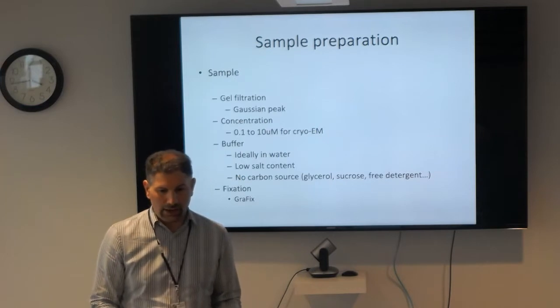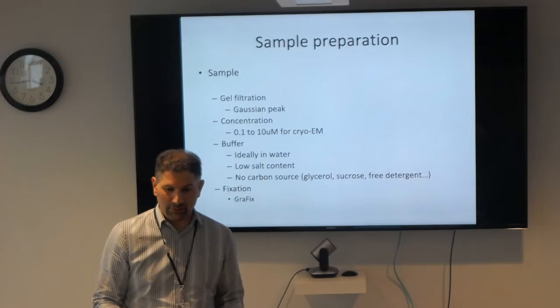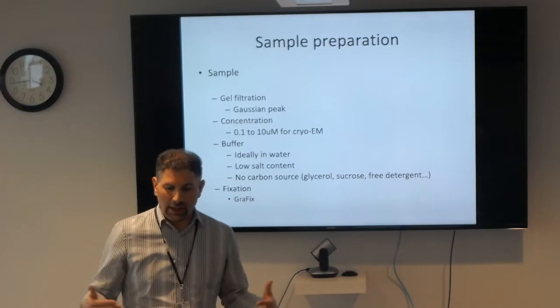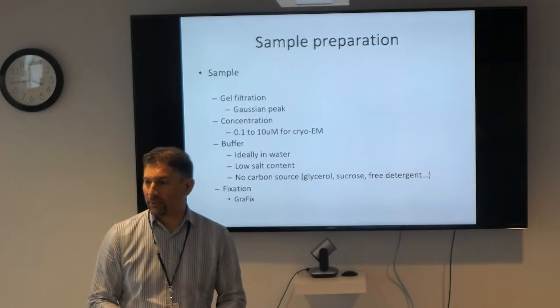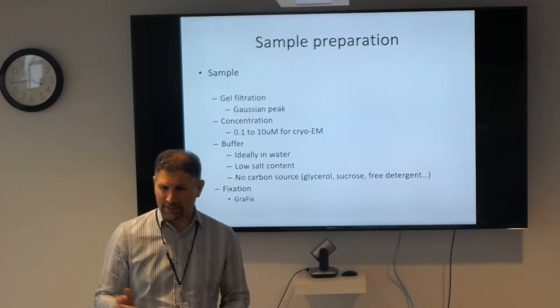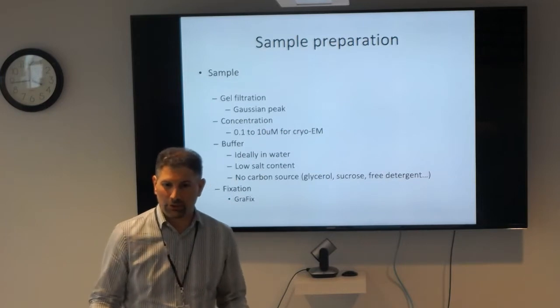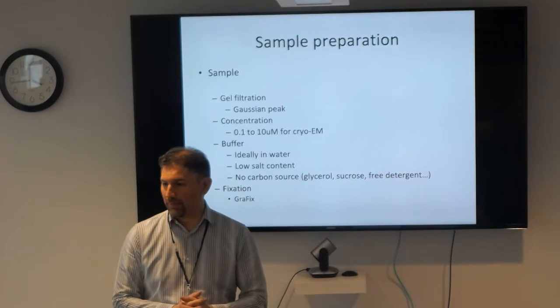Alternatively, you can try other types of grids where I think with gold, we've had some success, because gold is a noble metal, particles aren't supposed to stick to it, and particles are essentially ushered into the ice. So those are 2 ways of dealing with it. And I think if you read through the literature, there's a bunch of additional ways. But I really like David's method because you don't have to try a bunch of different crazy stuff. It seems like it plugs into the regular workflow and it works. You just need more sample. You just need more sample, exactly.